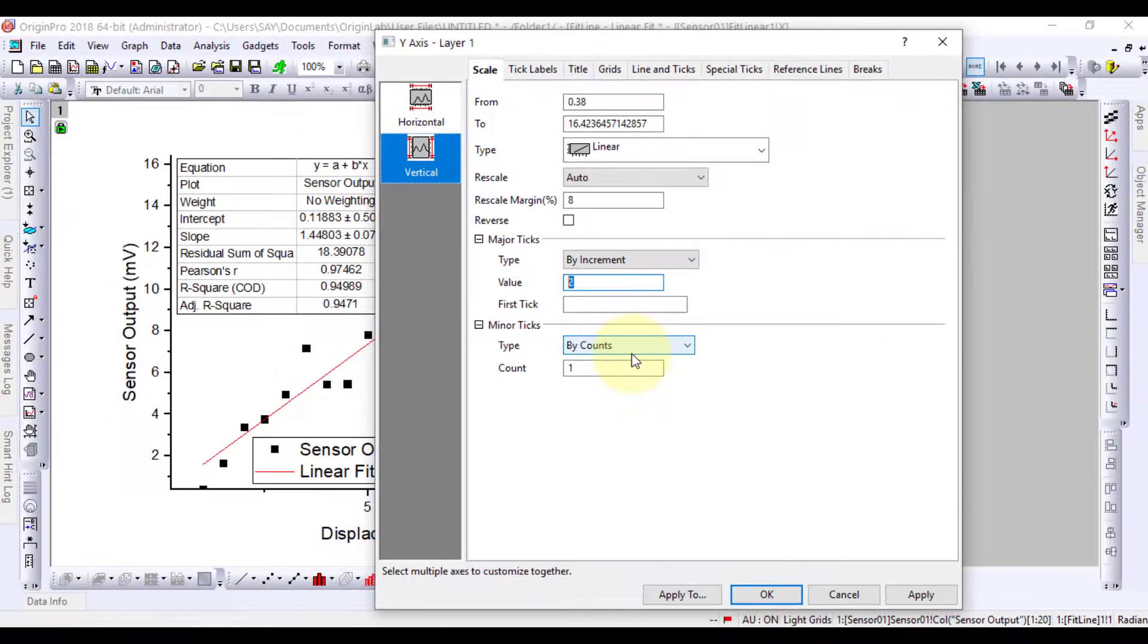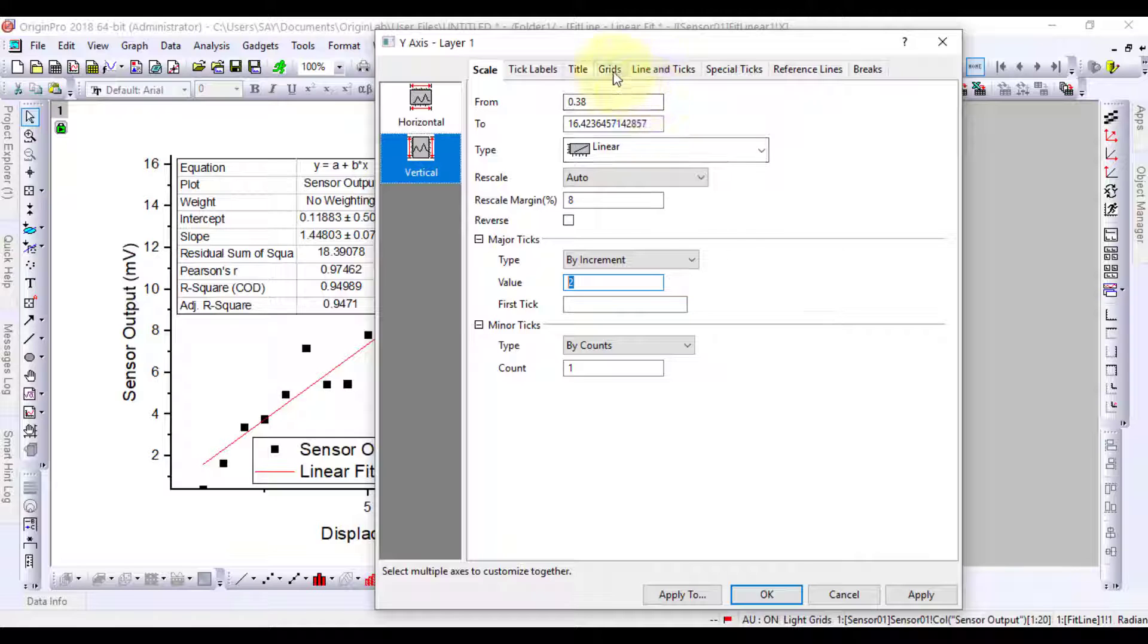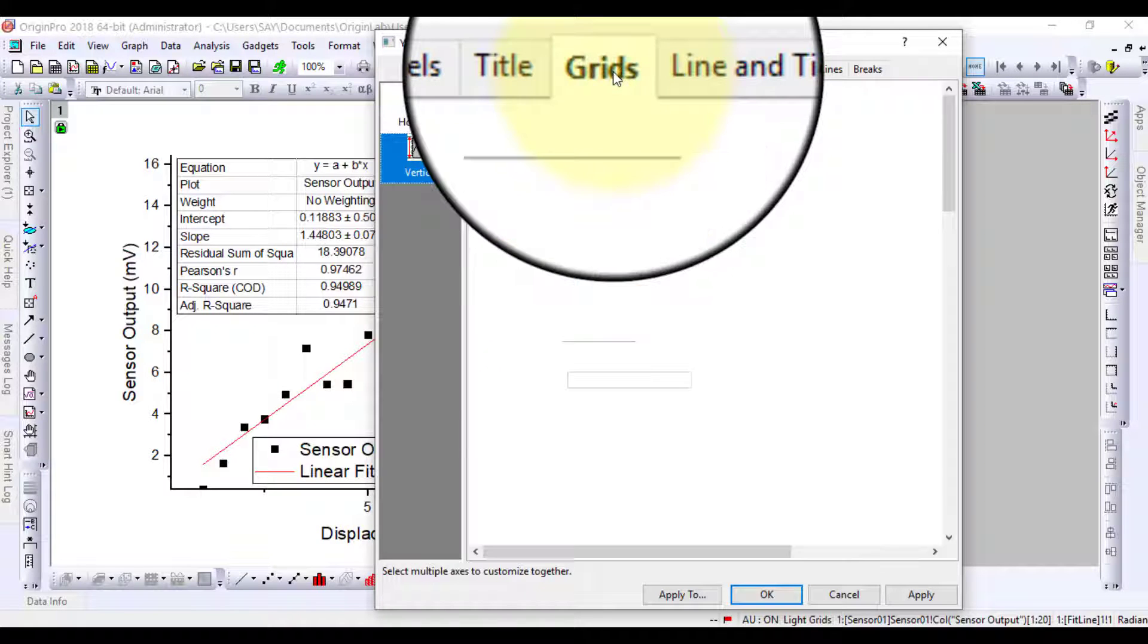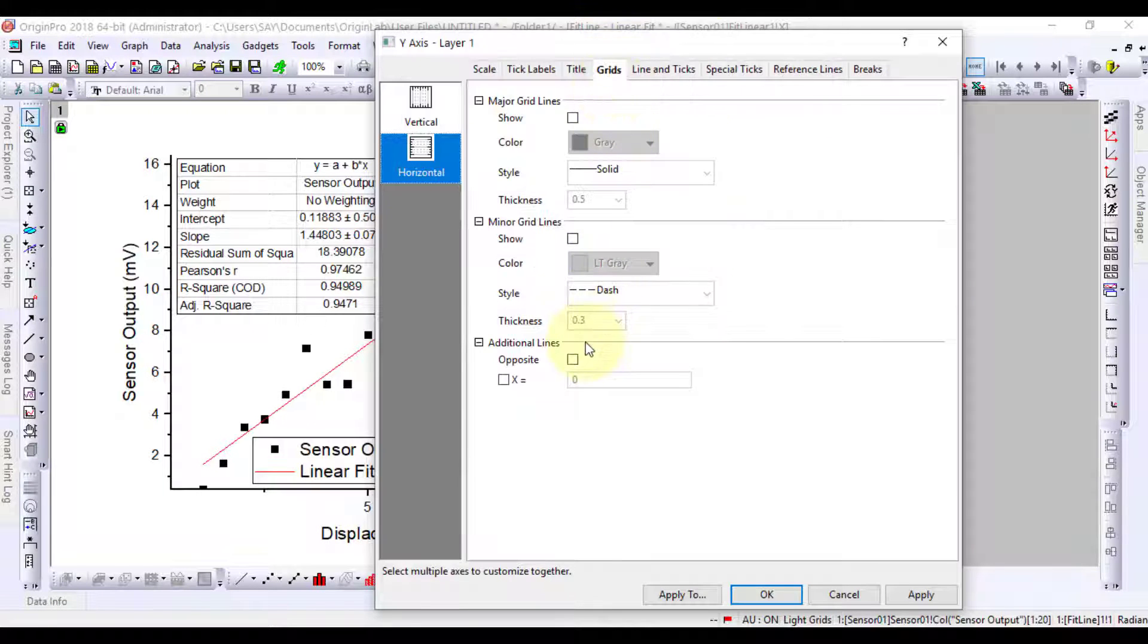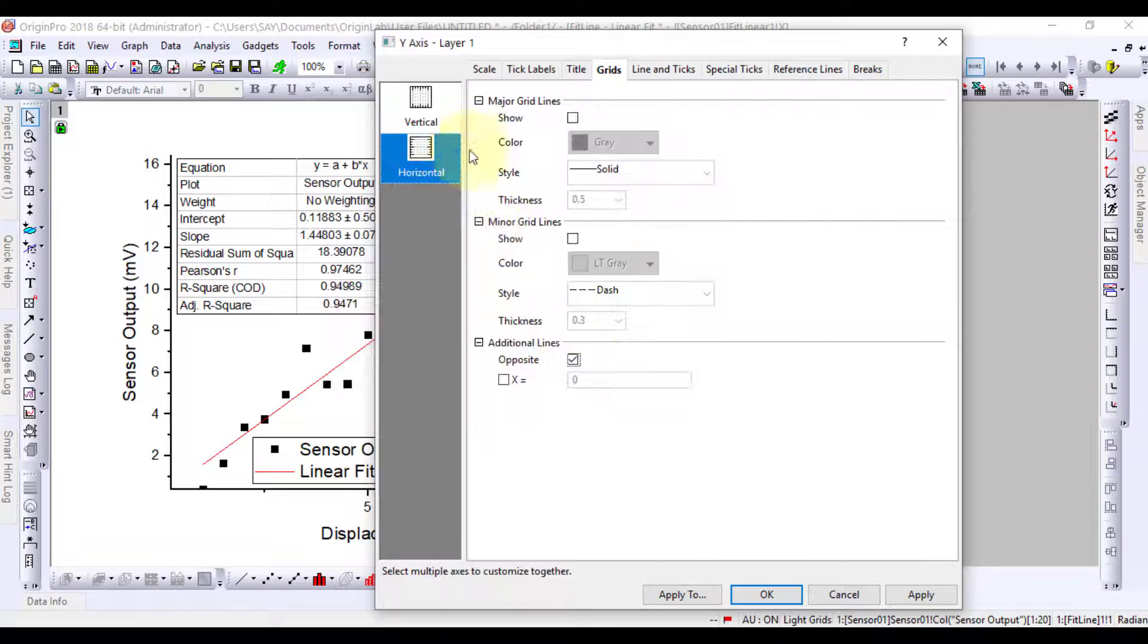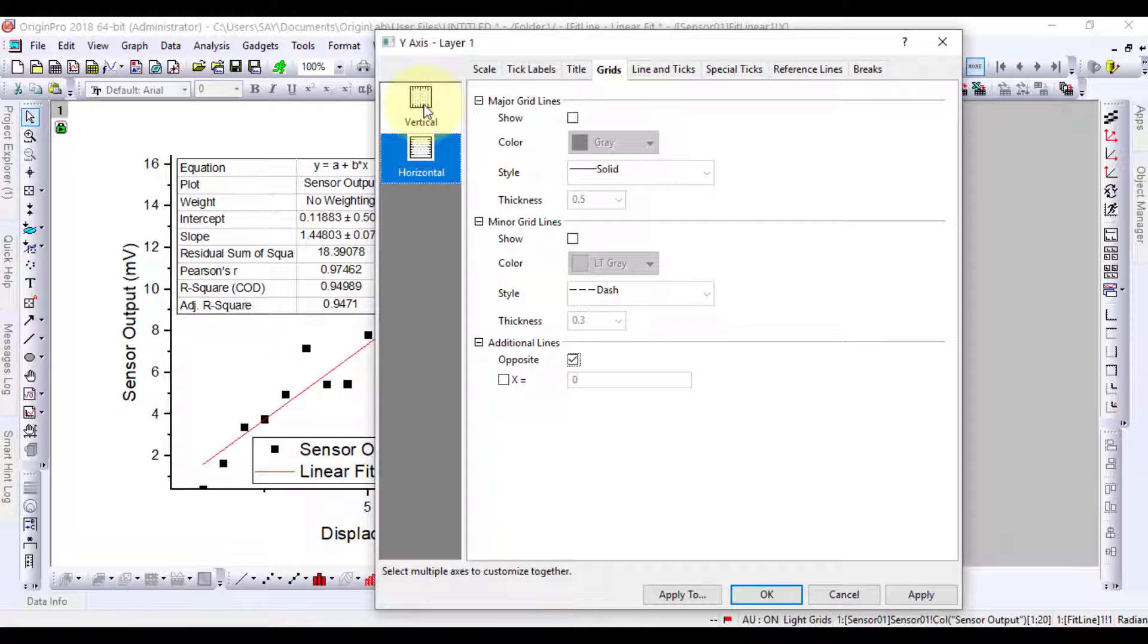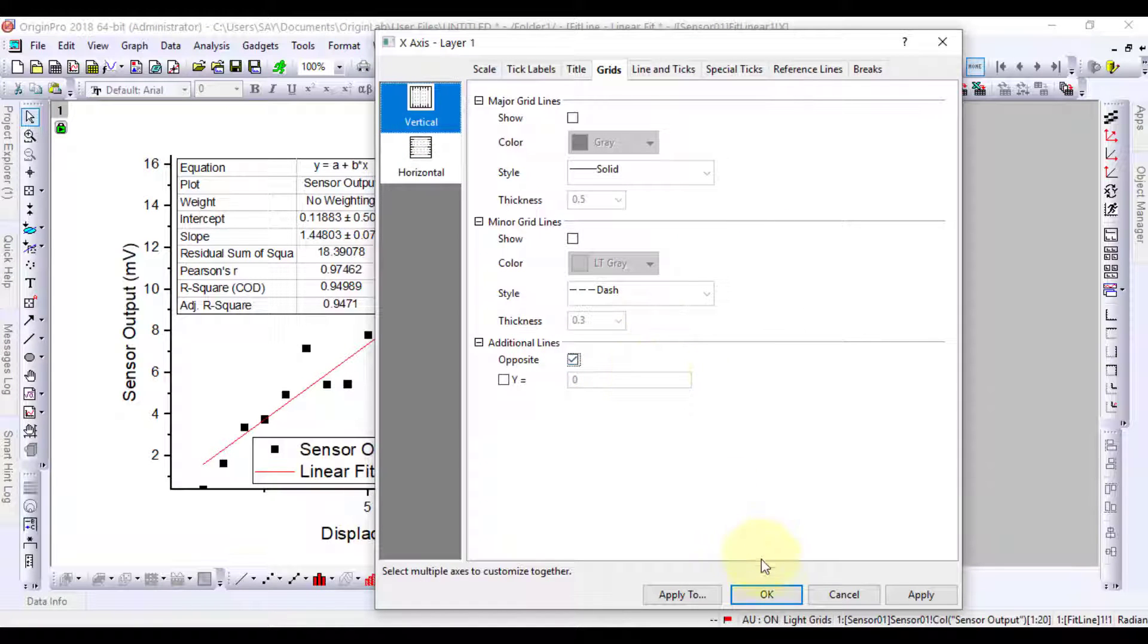Now, if the opposite axes are desired, we can do them for both X and Y axes. Apply the changes to the plot.